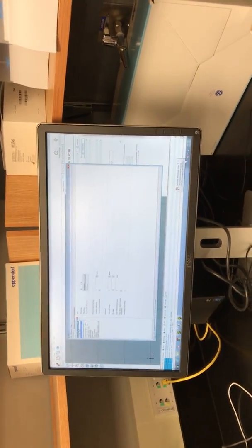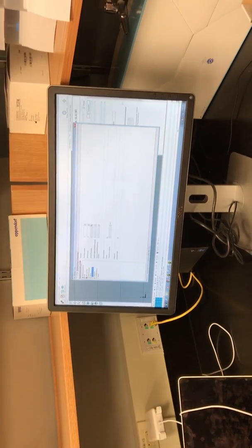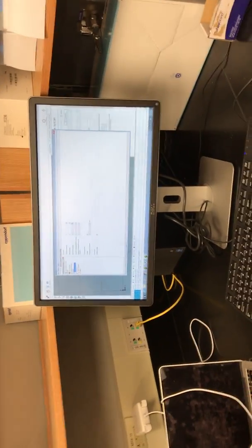The most common problem is that you change something here, and then you try to print something, and you're like, wait, I'm using the right print setting, but then you don't remember that you changed something in that setting. So it's always good that when you make changes, you just make a new file.